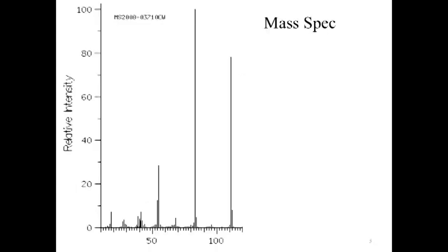Those of you that may have seen these kinds of spectra before might notice that this is an abbreviated spectrum, meaning that you typically don't see these spectra die like this. You almost always see it come out square. Sometimes you'll get weird results. This compound happens to give weird results, so being a relatively nice instructor, I deleted those weird results from our interpretation. Realize that when I give you something, I'm trying to give you something a little bit cleaner, easier to work with.